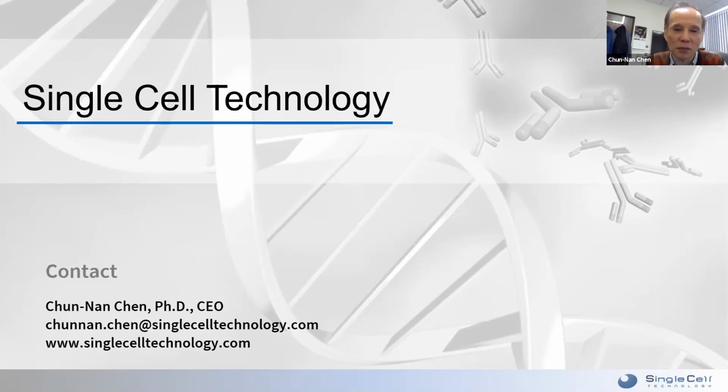I think that would be interesting, but on the other hand, you want to know what you're going to be looking at, right? If you're looking at transcriptome, you want to be able to associate that transcriptome with something else. If you just want to look at transcriptome, then the 10x Genomics approach, where you put the cells into droplets and sequence, will be enough, because you're not associating that transcriptome with something else. But I noticed that right now with some spatial genomics, they try to correlate the position of the cells in the tissue, for example. So that makes sense if you already have some other information.